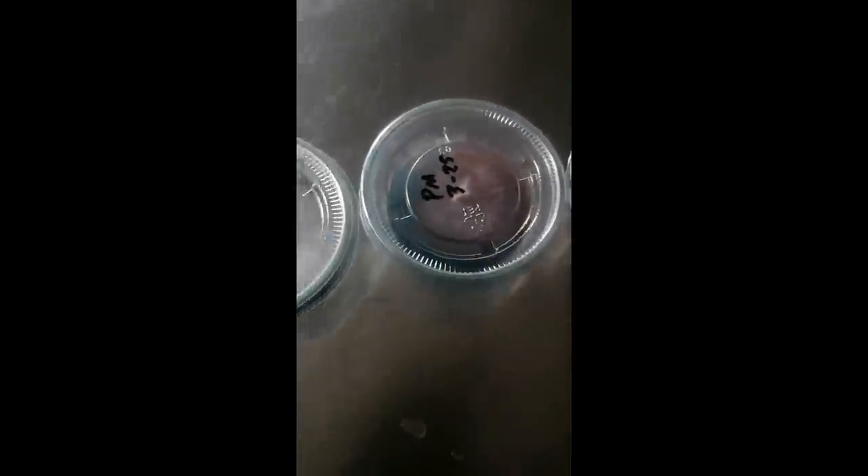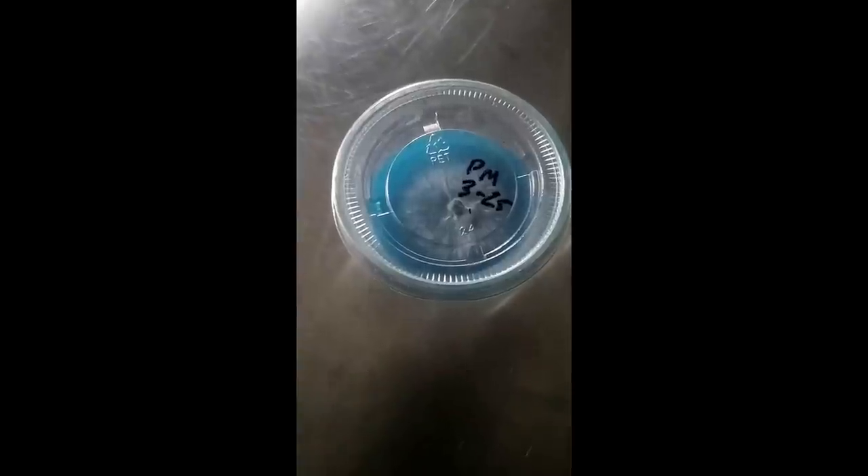Oh no — look at this. So this one's contaminated. You can see the coloration on that is just crazy. And this one's contaminated as well. I'm glad I took four — two of them are fine, two of them were contaminated. We'll throw those out, but just giving you guys a little update.